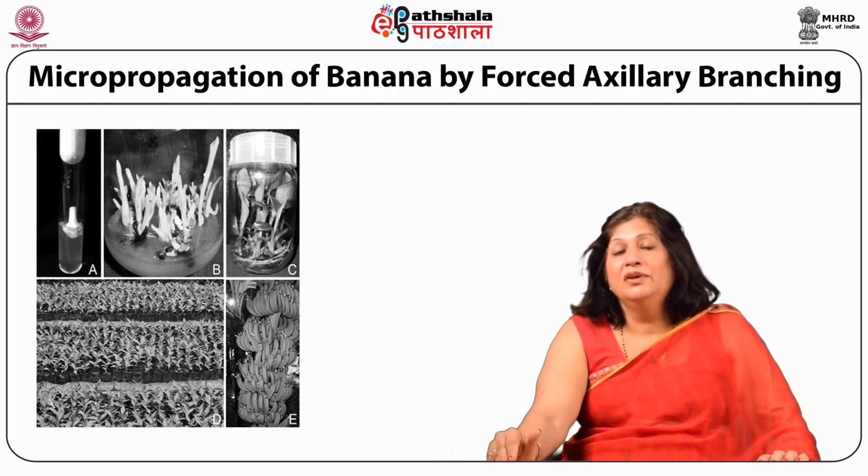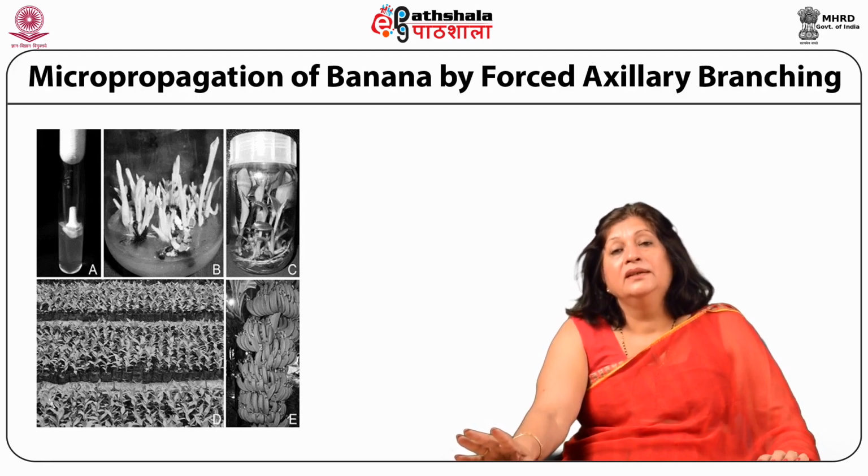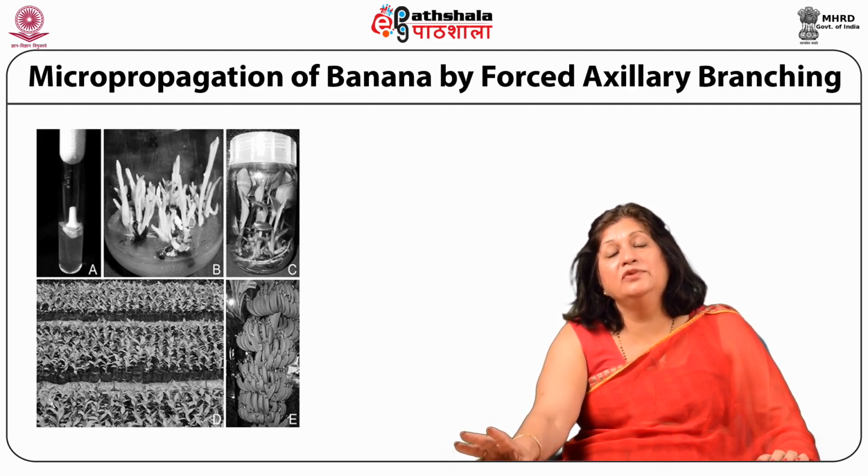So that is how one was able to produce a large number of plants of the selected clones by tissue culture technology. And in spite of the fact that we are keeping multiplication cycles as low as 7, it is still profitable. The plantlets are being sold for anywhere from 10 to 15 rupees a plant in bulk, of course, and they come with a quality assurance, both in terms of virus-free nature as well as clonal fidelity.